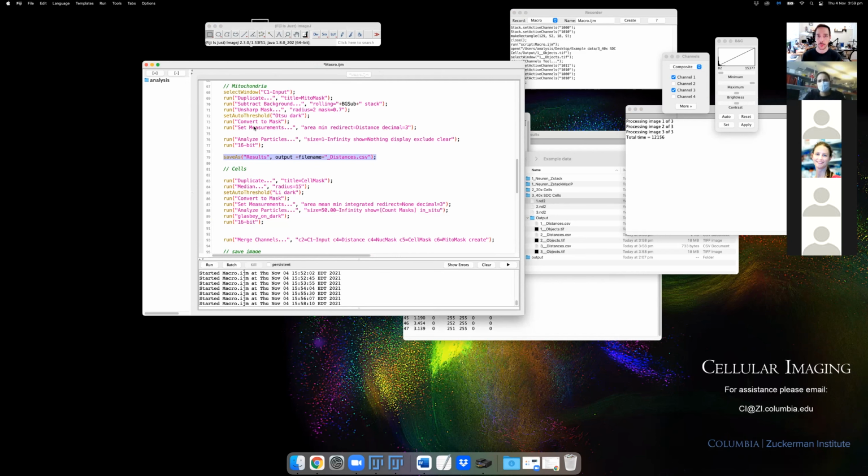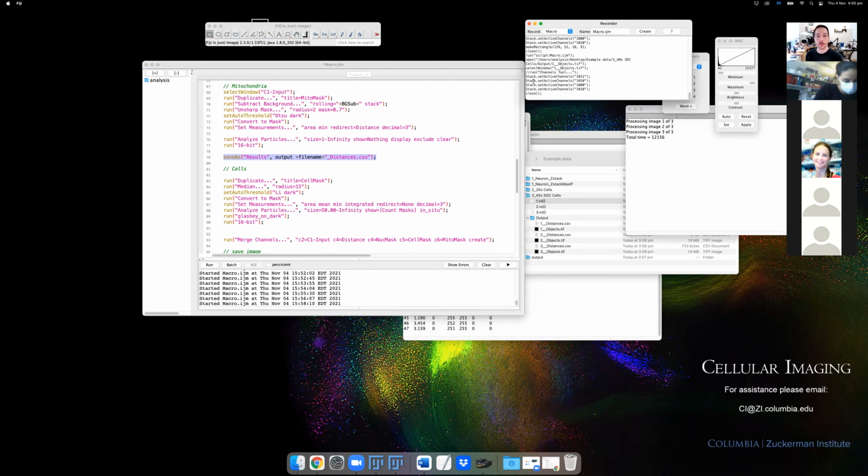And of course, this was just in 2D because, even going through this, it took us roughly 2 hours. But everything here can be scaled up to larger images, and it can be scaled in terms of doing 3D and complex things as well. And really, I think the power for this, especially if you're a biologist and you don't want to get too deep into scripting, you can see, hopefully it was clear enough today, how easy it is to use something like a recorder to work with images in a more interactive way, to understand how to get commands, and then use them in a macro so that you can process your data.